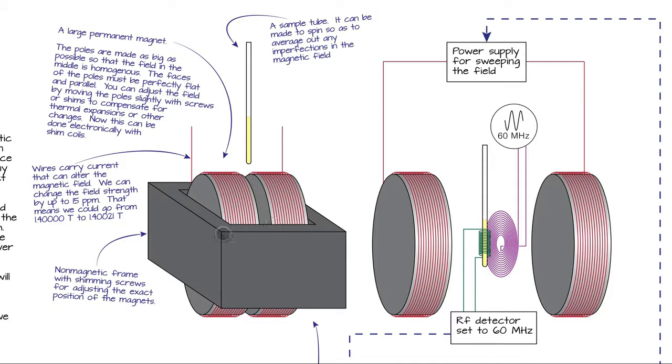surfaces of the magnets. And you have to put them in a sturdy holder that's not magnetic, that can keep them at the exact correct distance from each other. And if temperature differences are changing the size of your materials, and the exact parallel nature of these magnets is, say, drifting a bit, you would have to actually hammer wooden wedges down between the holder and the magnets to shim the magnet. So the word shim comes from a time when you would actually physically be moving these magnets with screws or with wedges to try and make the magnetic field as perfect as possible.